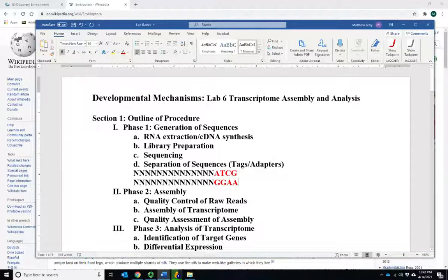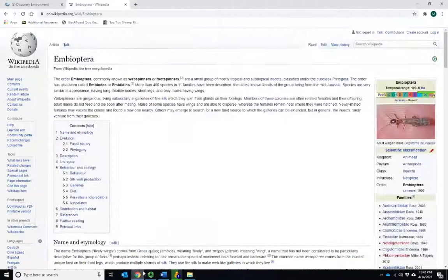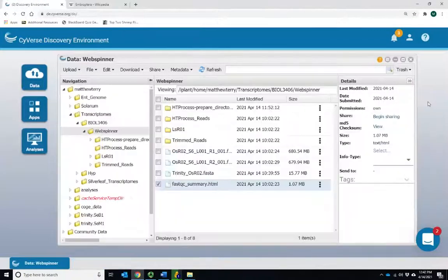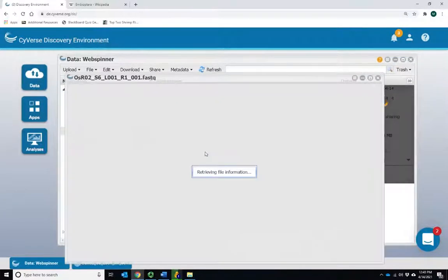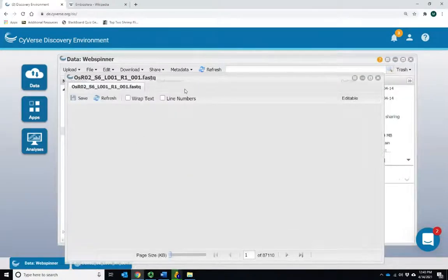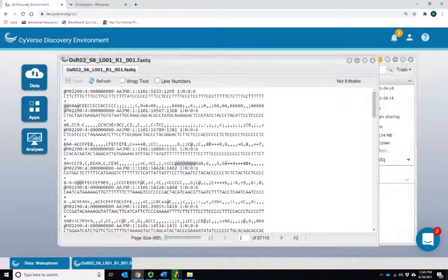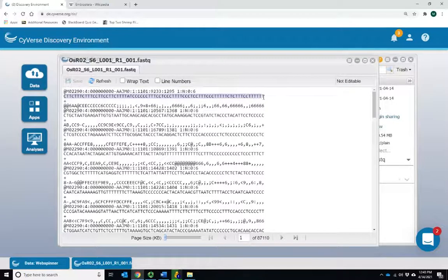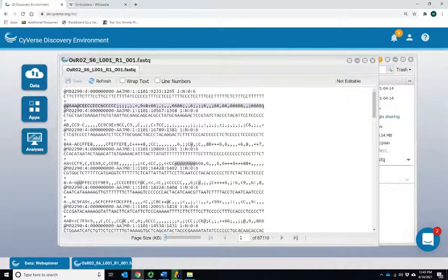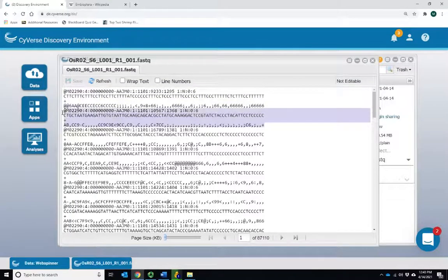The end result of this process is these raw sequence files. I'm just going to open one of them very quickly. This is a finished file, and it's only going to open the first little bit because it's a very long file. So here I've got a unique algorithmically generated identifier for that sequence, the sequence itself — all C's and T's, which is a little weird for this one. And then we've got quality control scores — those numbers there. These first four lines are for the first sequence; the next four lines are for the next sequence, and so on.